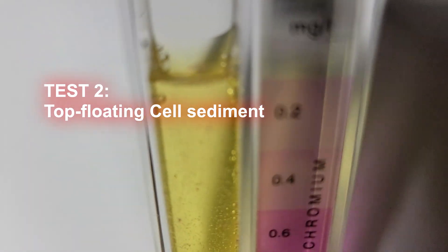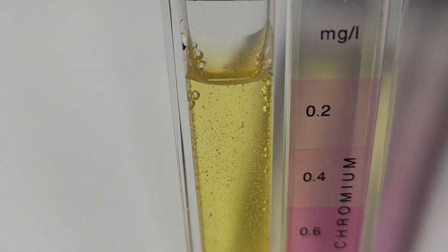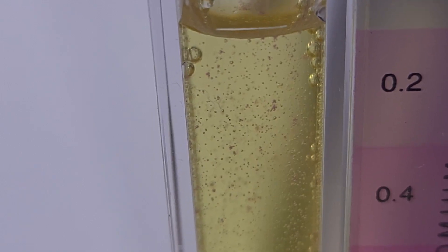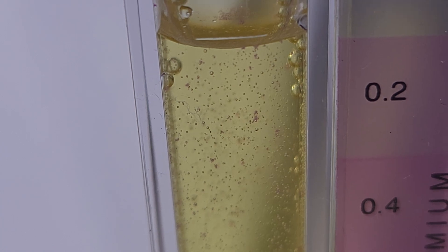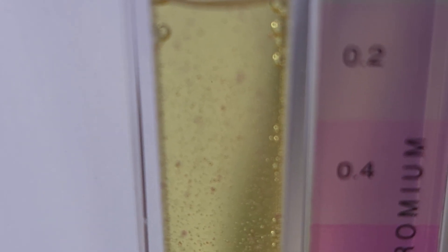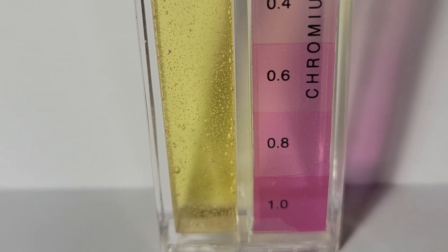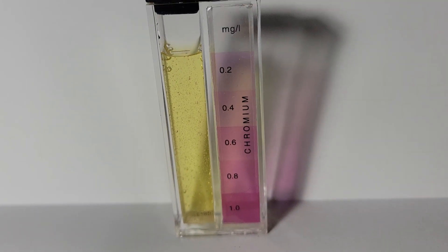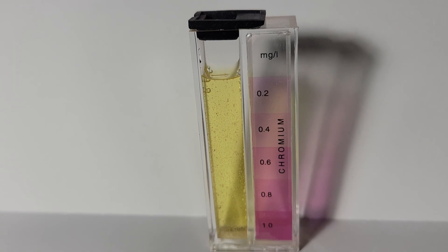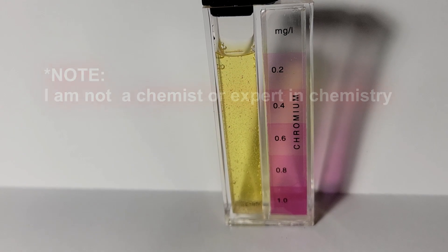Test number two. You can maybe just see a little bit of that purple contaminants in the background here. Let me try to manually adjust the focus to get beyond those bubbles. You can maybe see those little purple floaties in there. As far as a danger zone of parts per whatever volume I have in here, I wouldn't even consider that a 0.01 contamination per volume — relatively safe, given the water volume we're dealing with here.